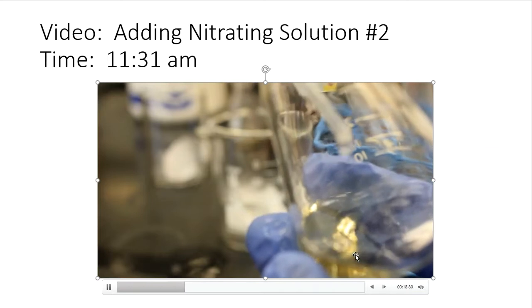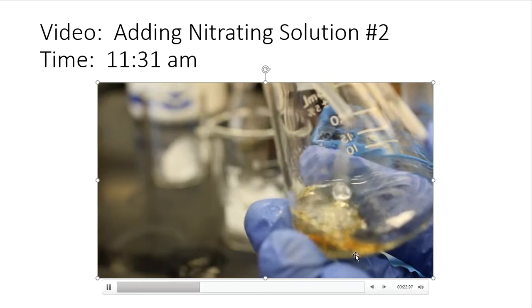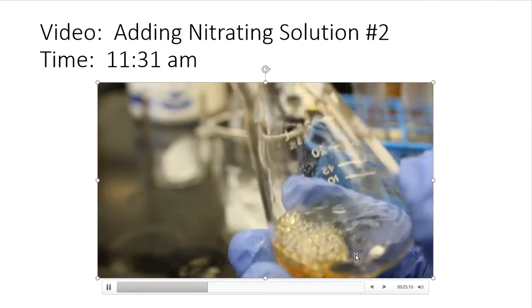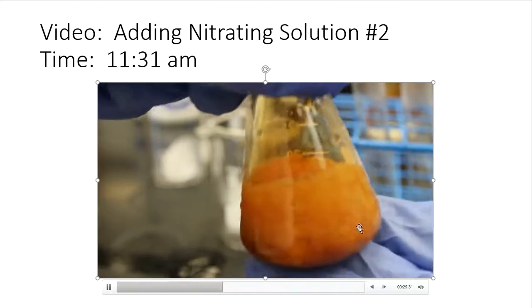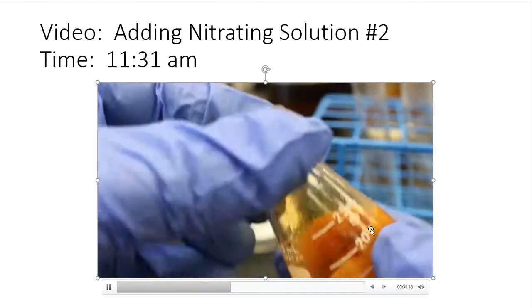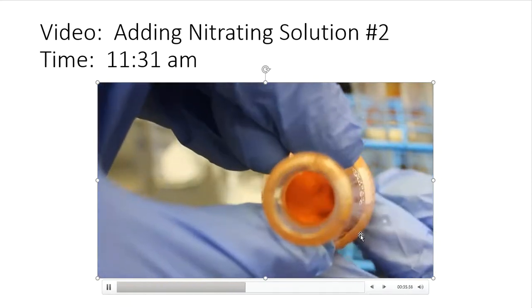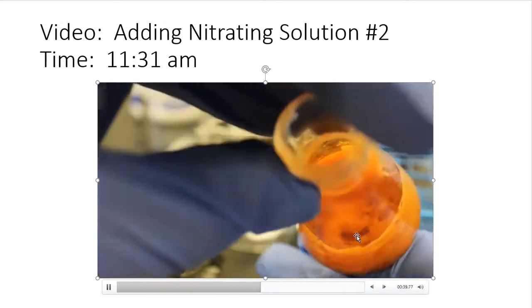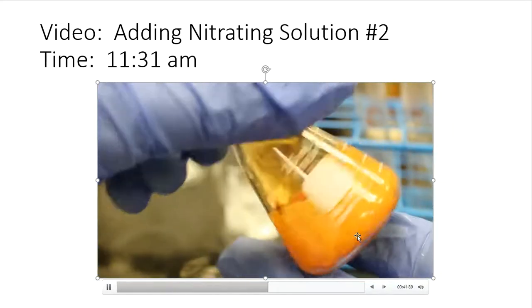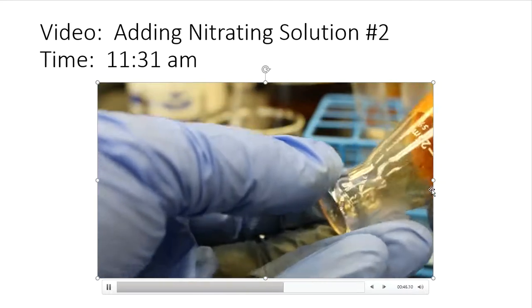Observations. And there we go. Look at that. Total difference. You can even hear the sizzle of the steam that's coming off of that flask. It is warm on the bottom.